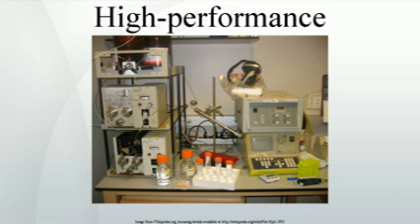Displacement chromatography has advantages over elution chromatography in that components are resolved into consecutive zones of pure substances rather than peaks. Because the process takes advantage of the nonlinearity of the isotherms, a larger column feed can be separated on a given column, with the purified components recovered at significantly higher concentration.